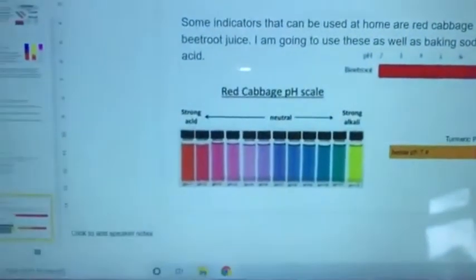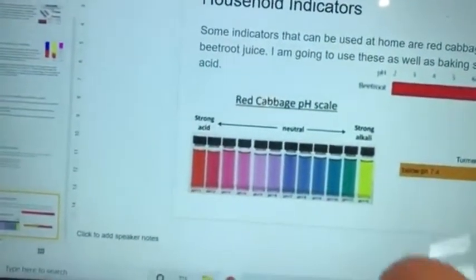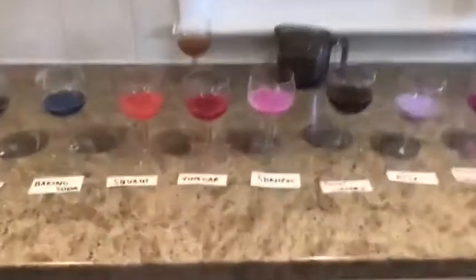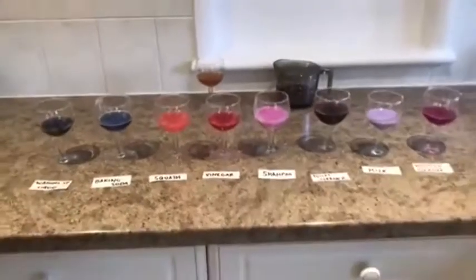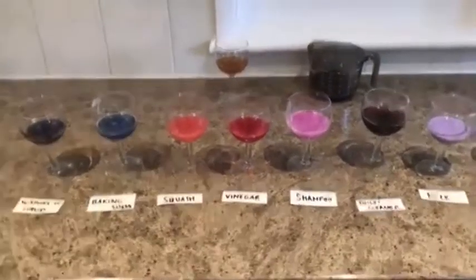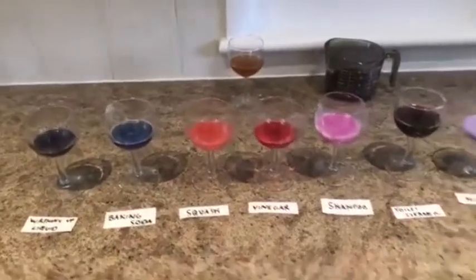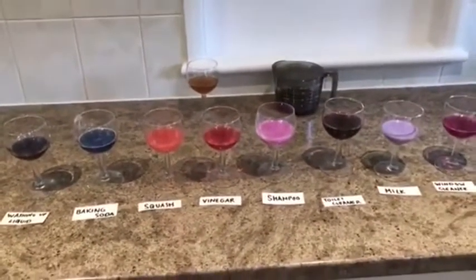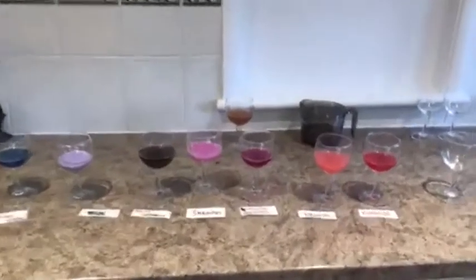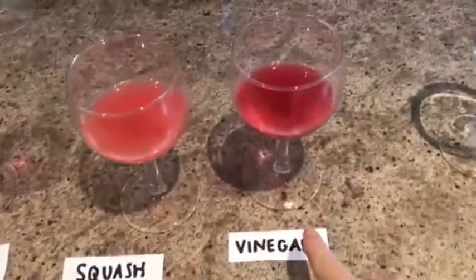This is the red cabbage pH scale, which I actually didn't use because of the results, but it goes from strong acid to strong alkali. And then these are the results with the red cabbage juice. They did come out differently to what I thought they would, because I think we used too much cabbage in the cabbage juice, but the washing up liquid and baking soda is quite blue compared to the vinegar.